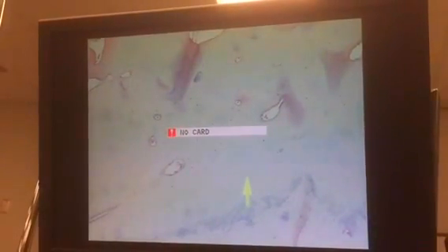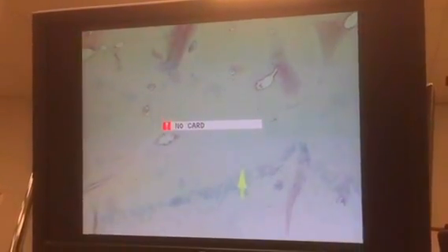And in this case, even though it's not described as having calcified cartilage, you do have a little bit right there. So this is all fibrocartilage. Not as nice as the fibrocartilage as we saw last semester.